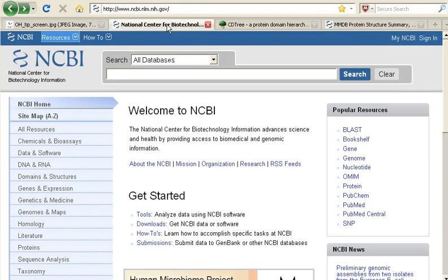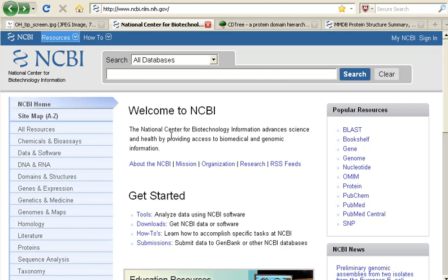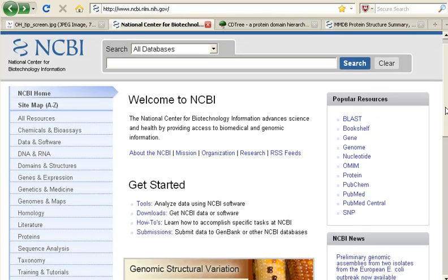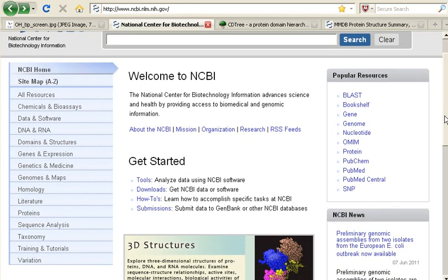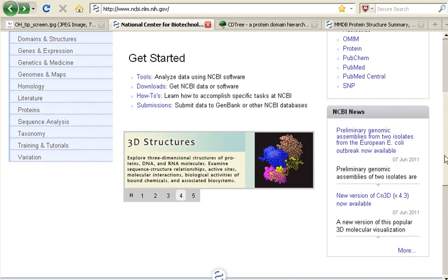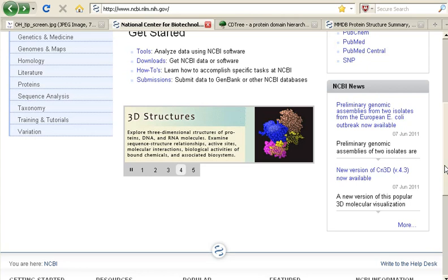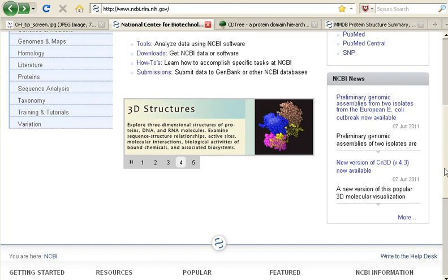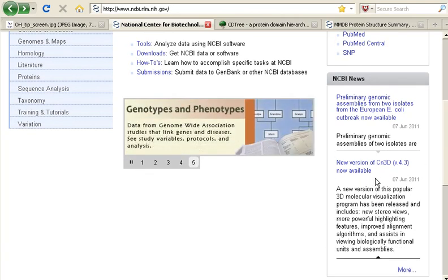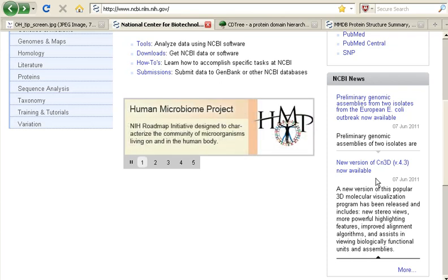Fairly often, I like to head over to the homepage for the National Center for Biotechnology Information, otherwise known as NCBI, which you can access at this address, and check out whether they have any new tools or what tools have been updated. Today when I did that, I noticed they have released a new version of the CN3D Molecular Visualization software.